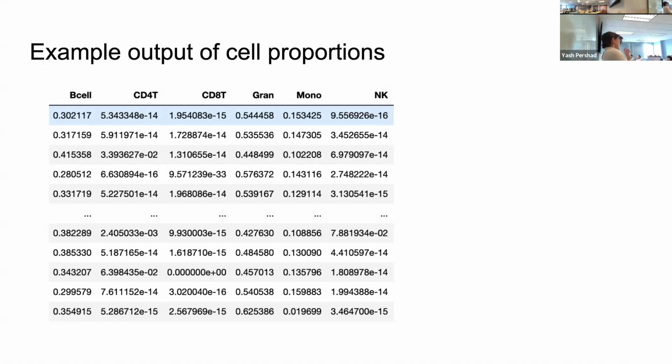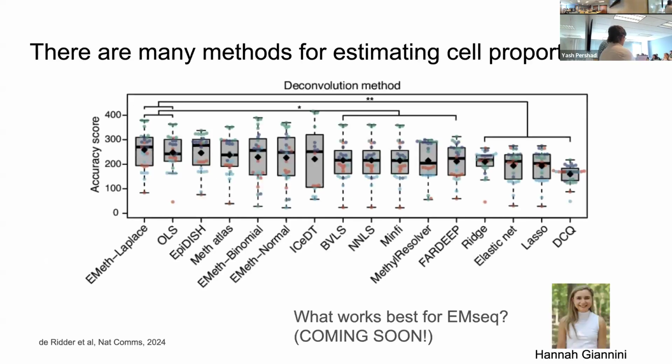These softwares, there are two, methyl CC and then EpiDish, that we typically use. It's like one line of code. So these are really straightforward and fast to use, and the output's really quick. And I provided some code that we use to run this.